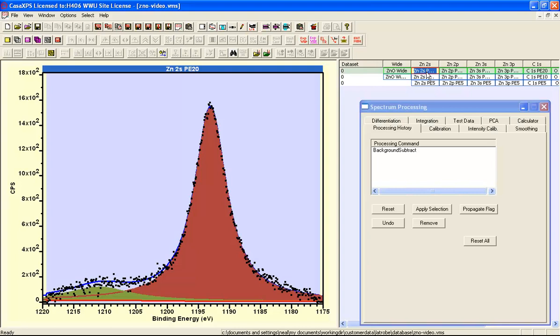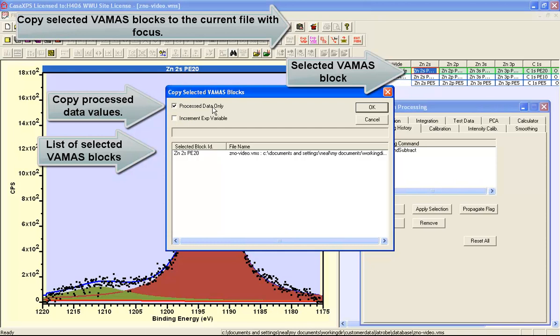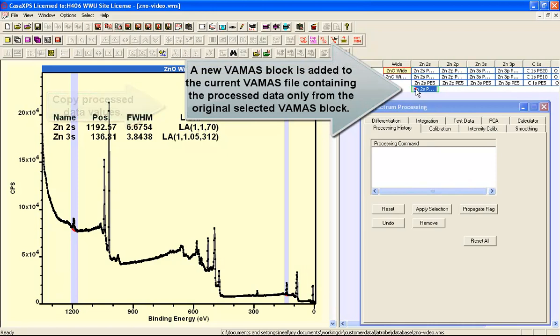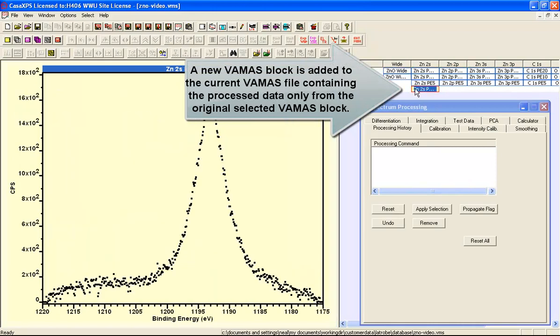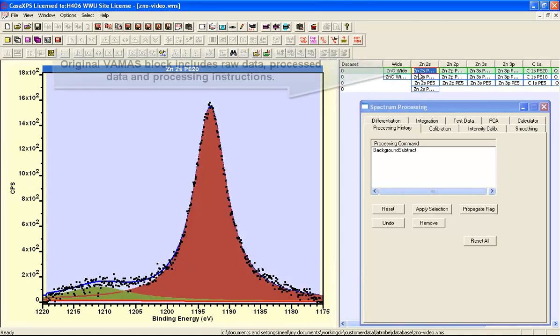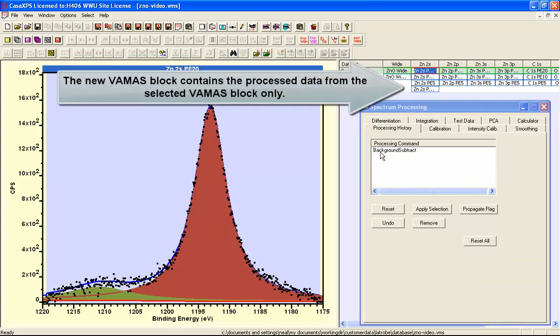We can copy the process data using the copy toolbar button and selecting the process data only, then select the OK button. A new VAMAS block is created, and the new VAMAS block contains only the process data, whereas the original VAMAS block contains the raw data, the process data, and an instruction on how to process the raw data to get the process data.